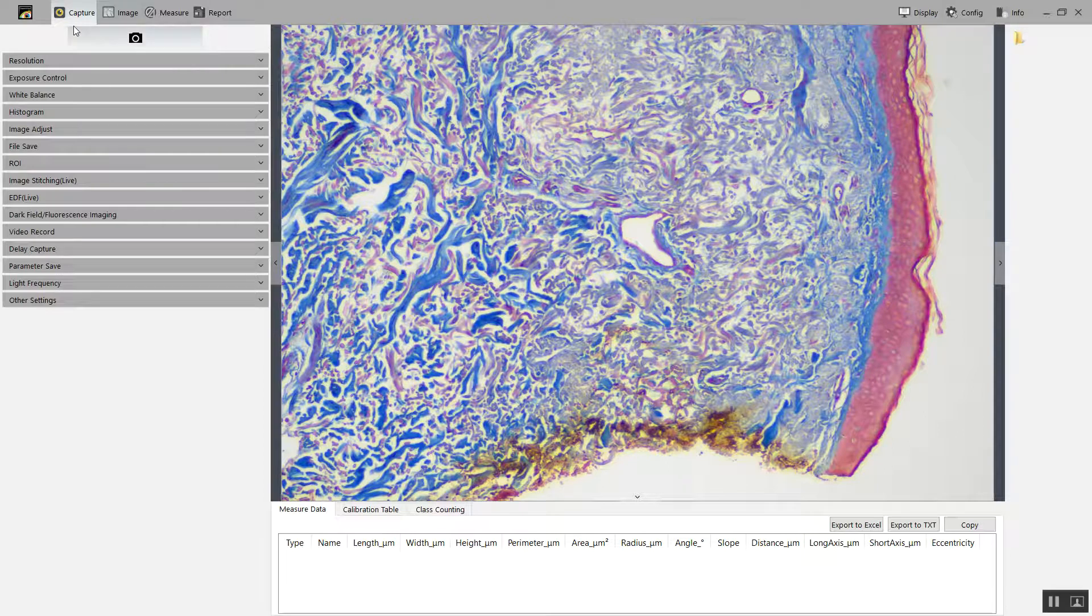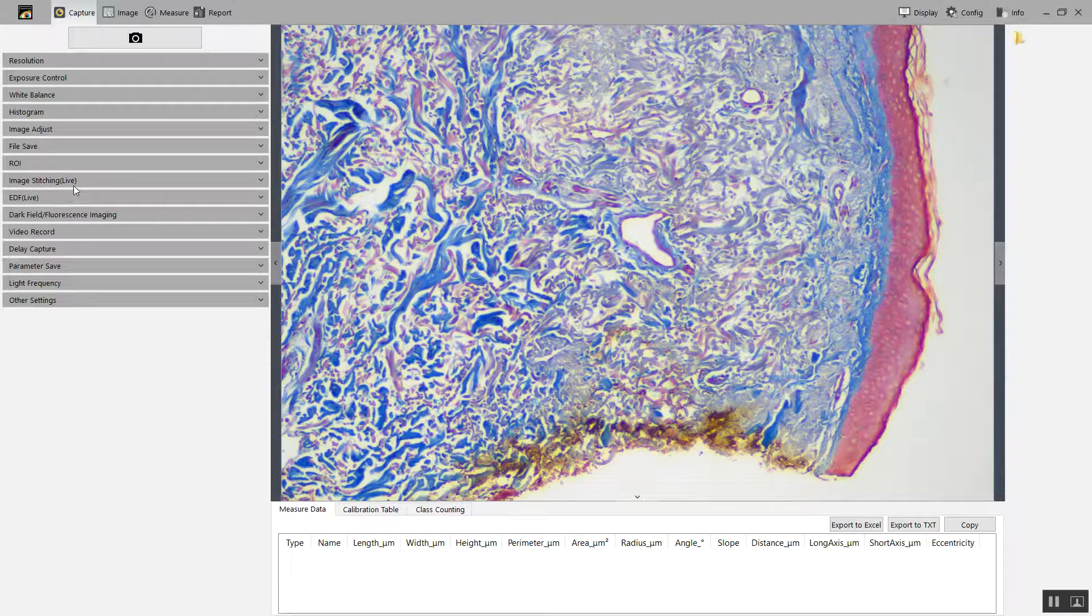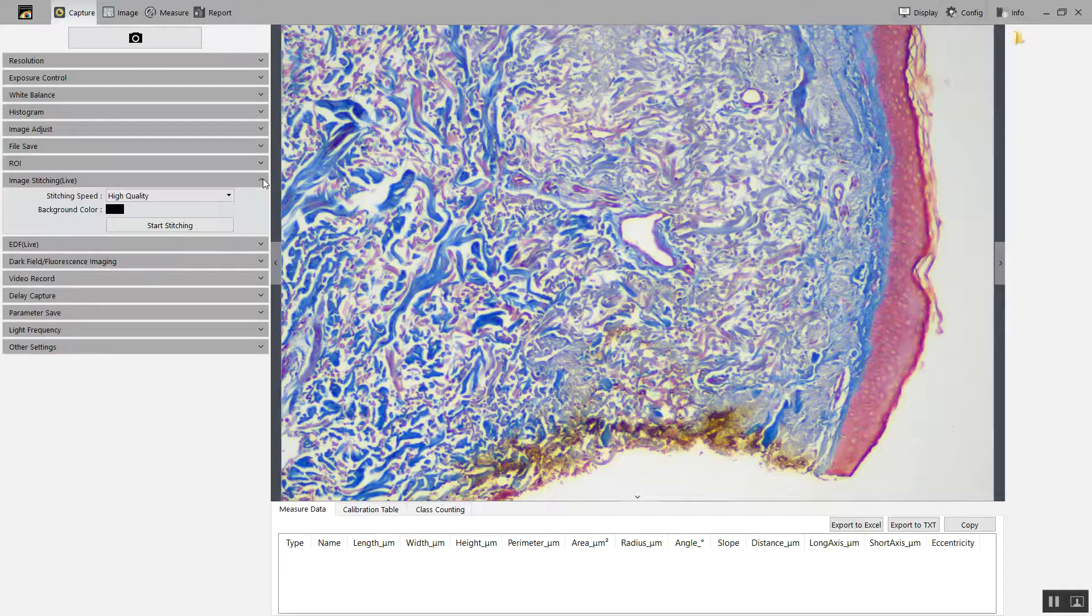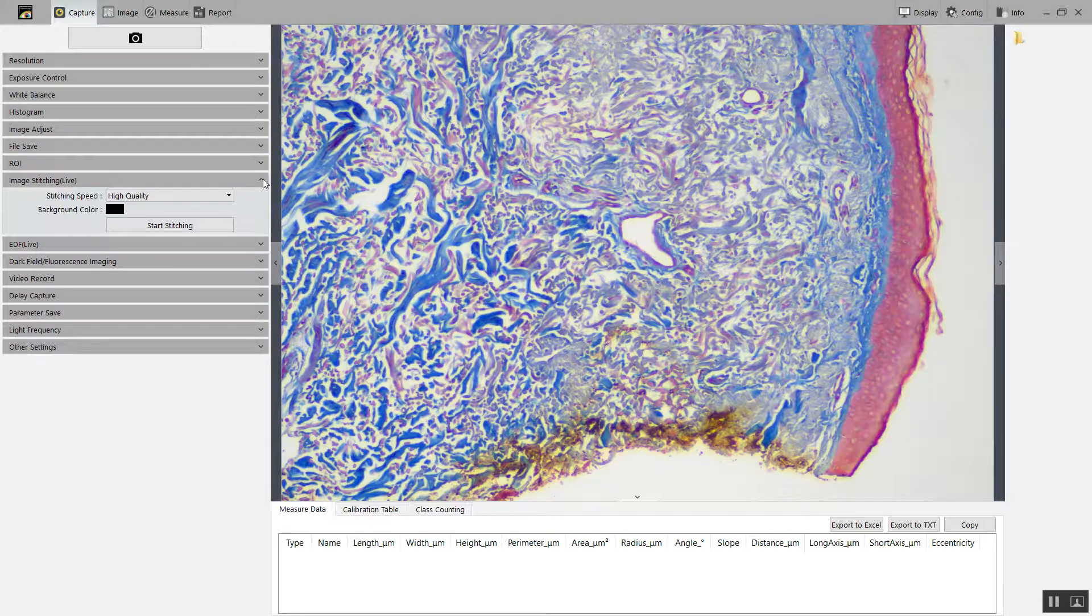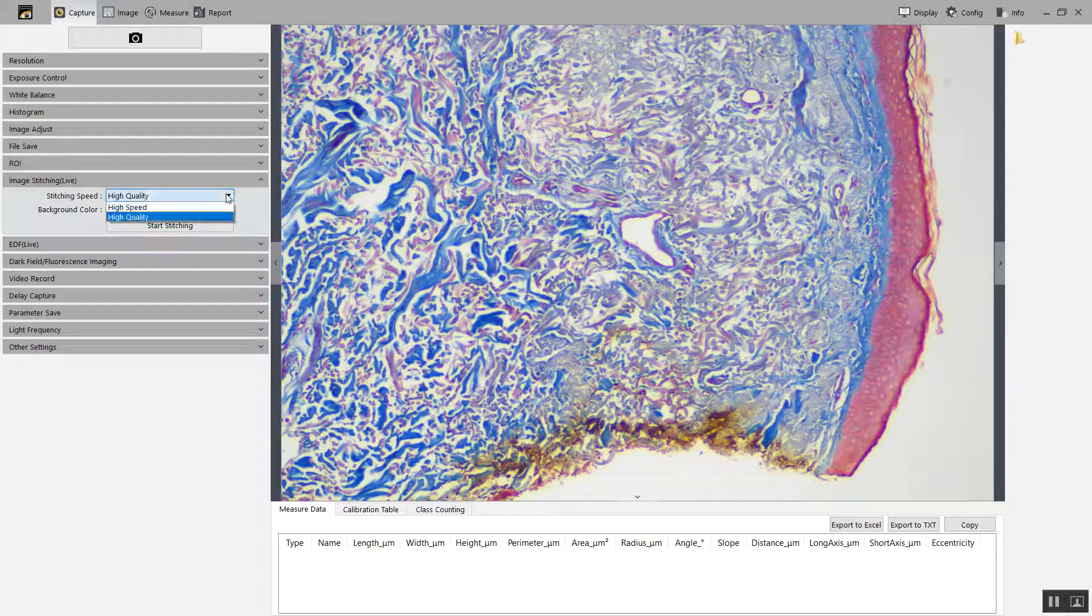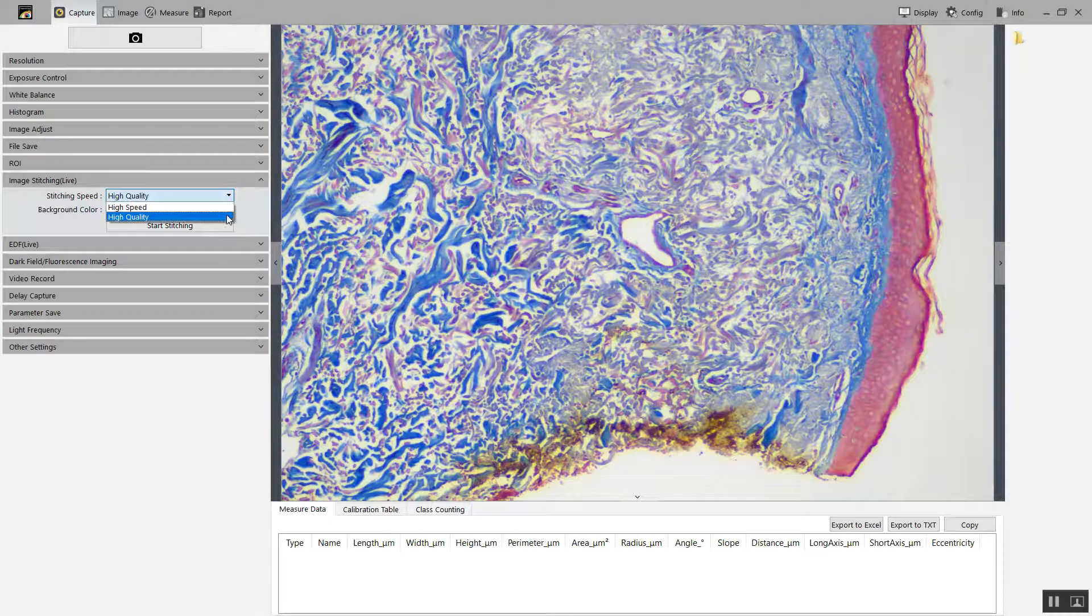Here in your capture tab is image stitching live. This is the function we're going to learn today. The options you have here are stitching speed: high quality or high speed. I'm going to choose high quality.